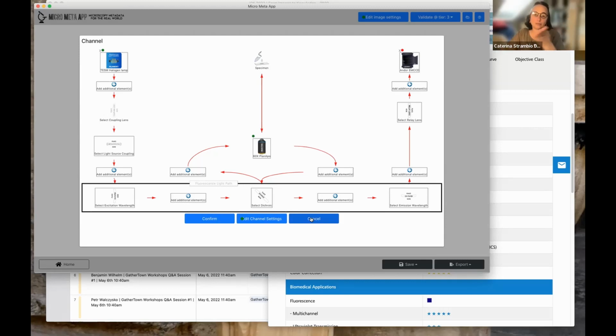And then Joel now will tell you about MethodsJ2, which will help you do some of this stuff in a slightly different way, and also generate the methods sections that are written out. So we need to be able to make it as easy as possible, as automatic as possible, and at the same time also provide user value at the end.